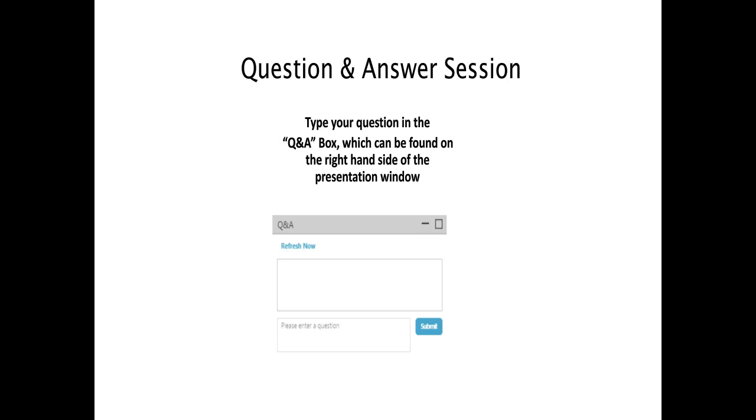Okay, thank you, Annette. Next question. The response in HILIC, is it lower than RP? The response, I'm not entirely sure what is meant by that. Maybe that's something we can ask of the person that offered that question. I don't know if that means in terms of peak signal perhaps or sensitivity.